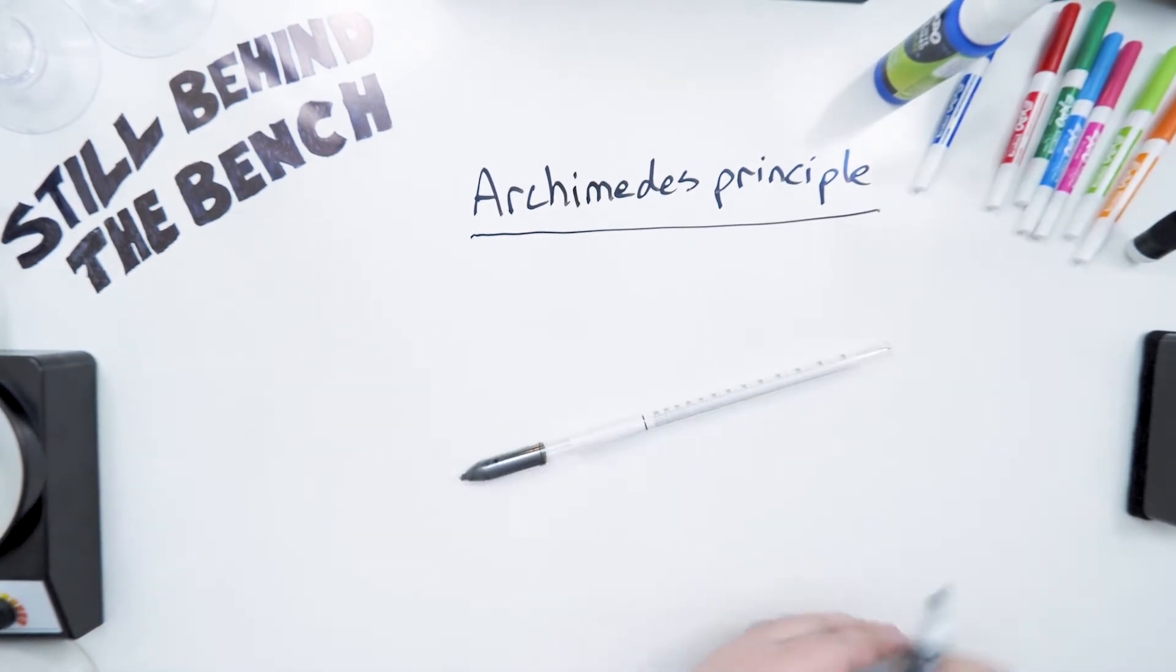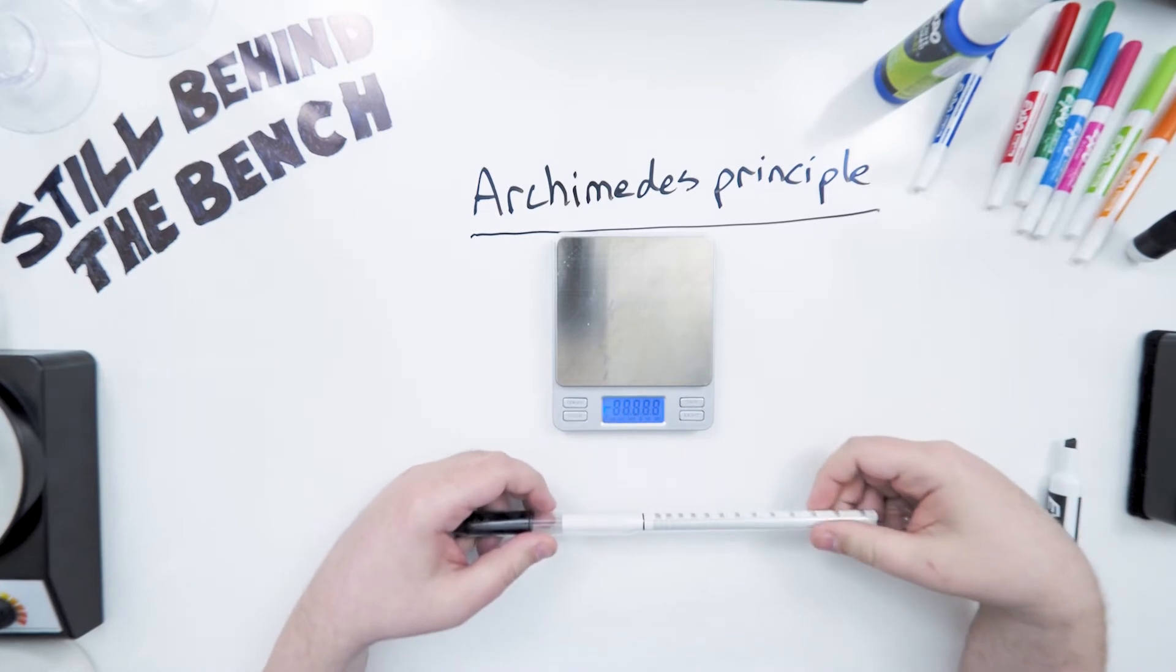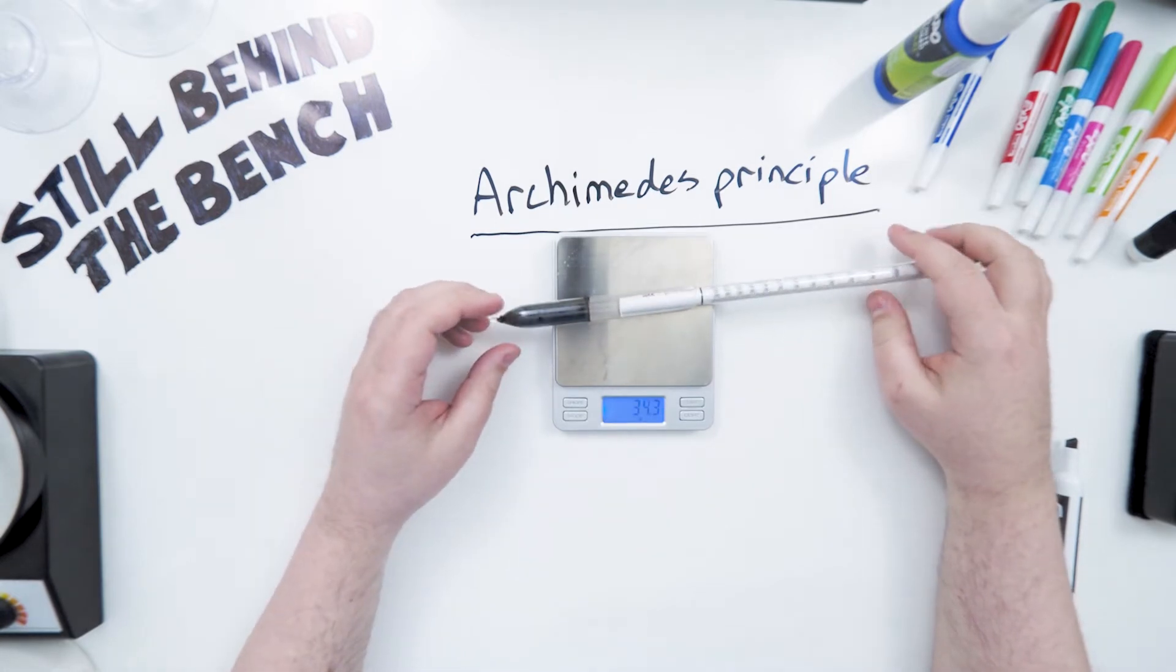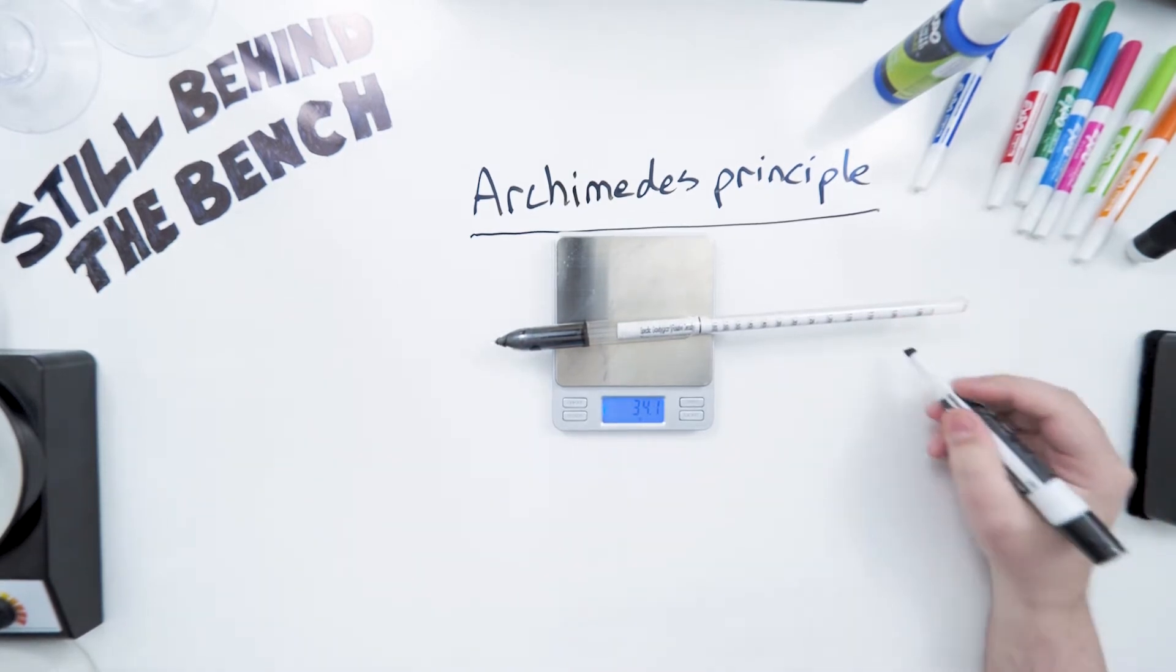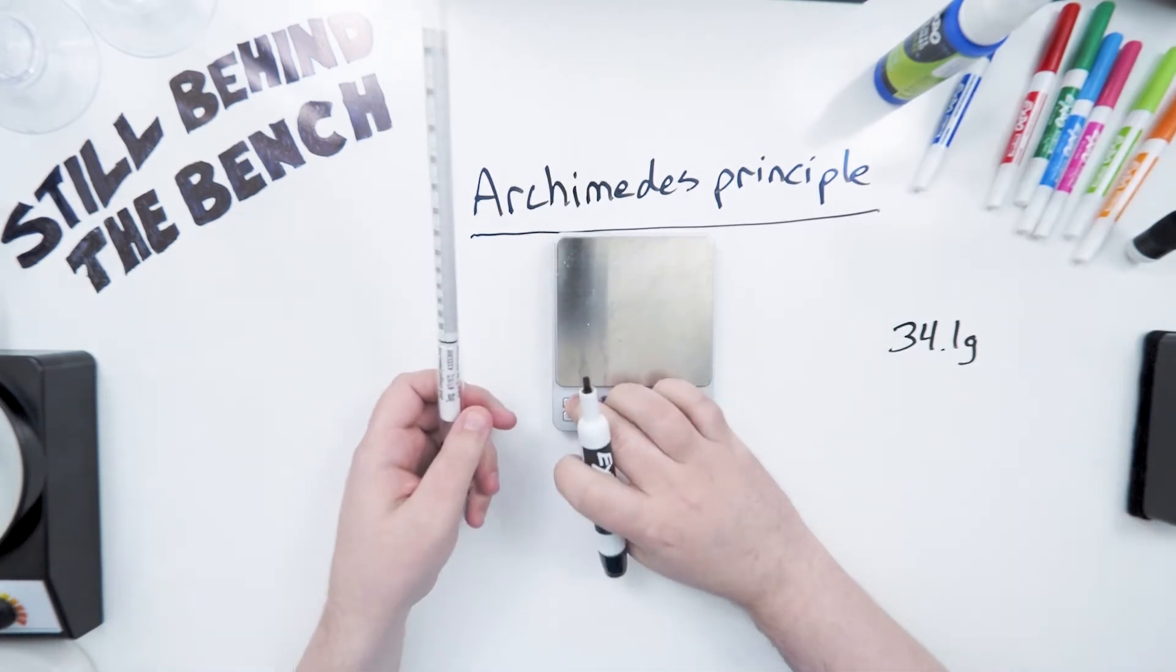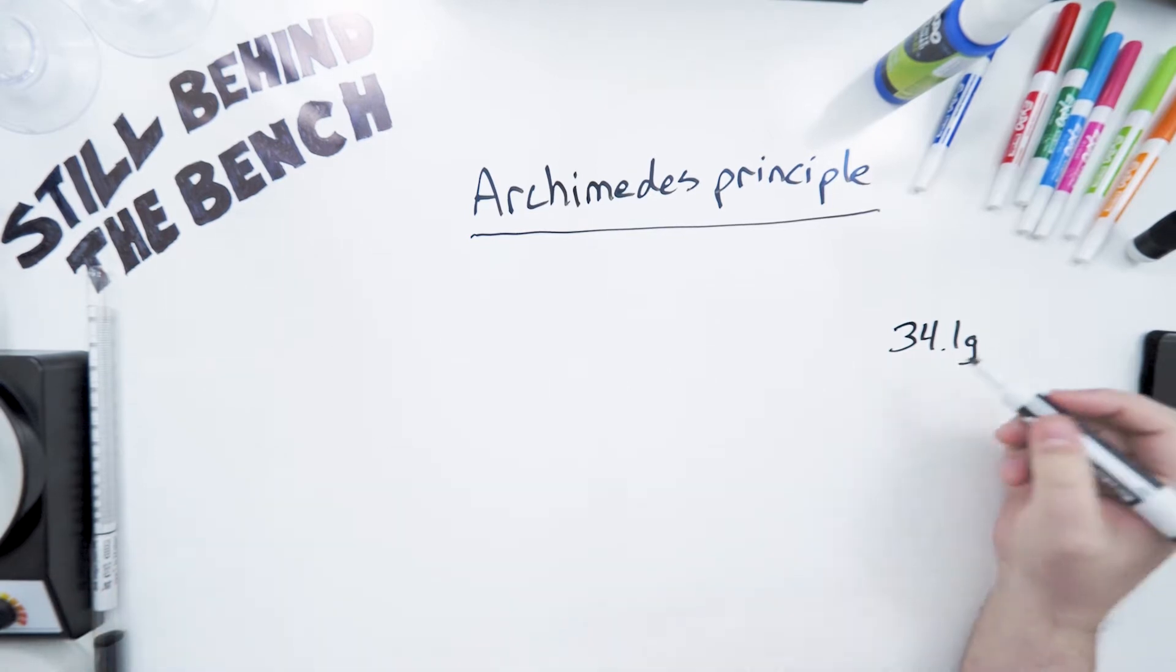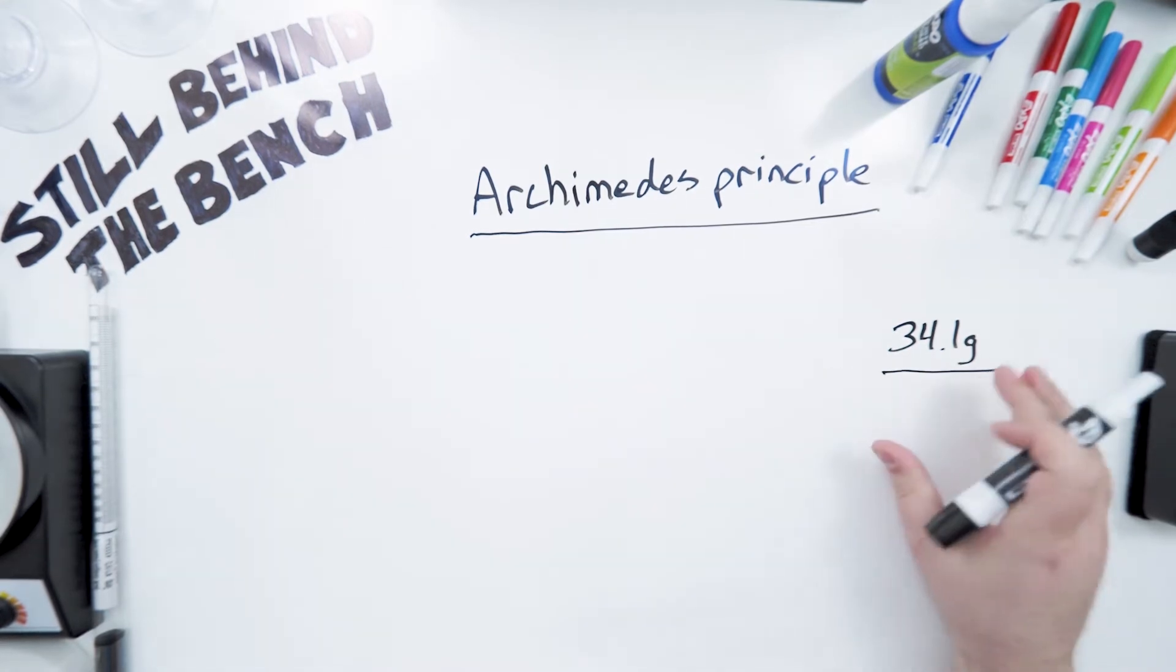So this hydrometer, we'll weigh it and see what it weighs. And it wants to roll. All right, 34.1 grams. This means, regardless of what liquid is in the cylinder, the test cylinder that we'll be using, this hydrometer will always displace 34.1 grams worth of liquid.